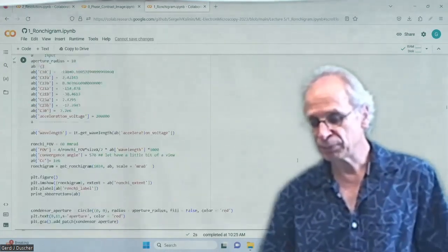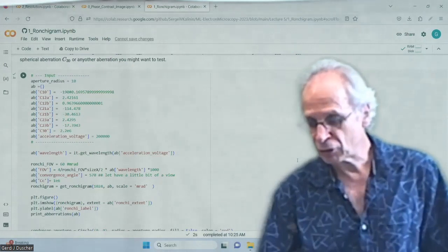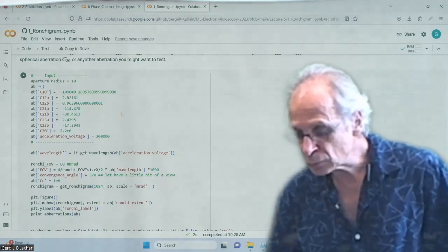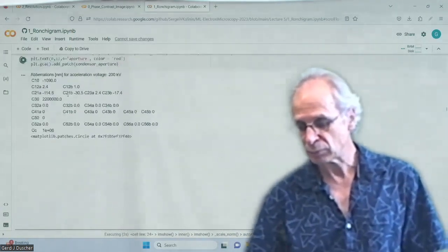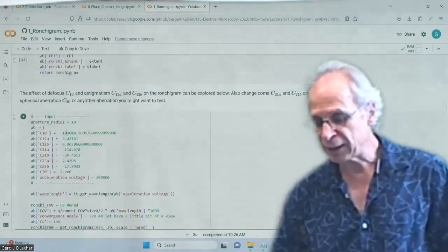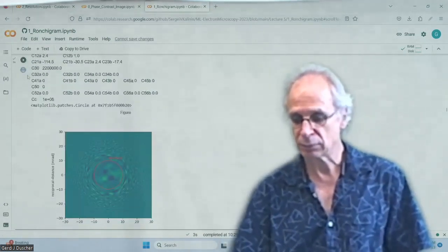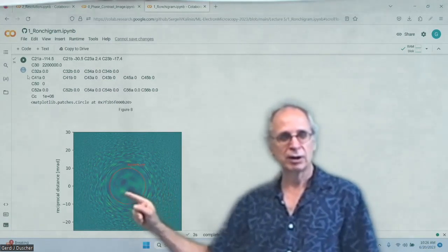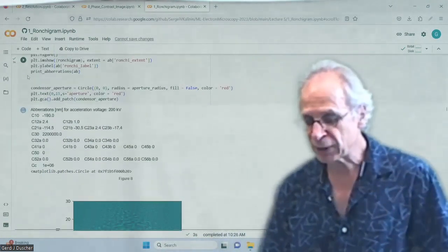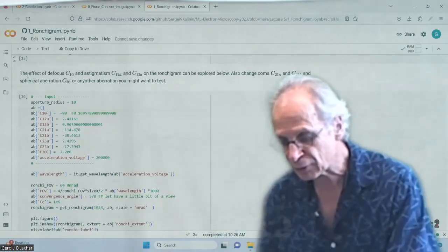And here we have now less of a defocus. Let's change the defocus to something larger, something like 1,000. And we get the V-like structures that we had before at 190. We get something that is looking much more blobby, but you see there is still some kind of features in here. We want to have much less of that. So if we go to minus 90, let's get rid of this stuff.